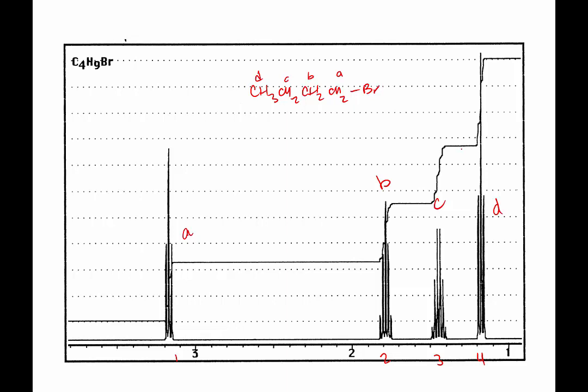And I guess part of what I'm showing you is we couldn't tell the difference between methyl and ethyl before with any spectroscopy technique, right? IR, everything was an alcohol. But now I can tell the difference between an n-butyl and a tertiary-butyl and an isobutyl, if it was there, and a sec-butyl.